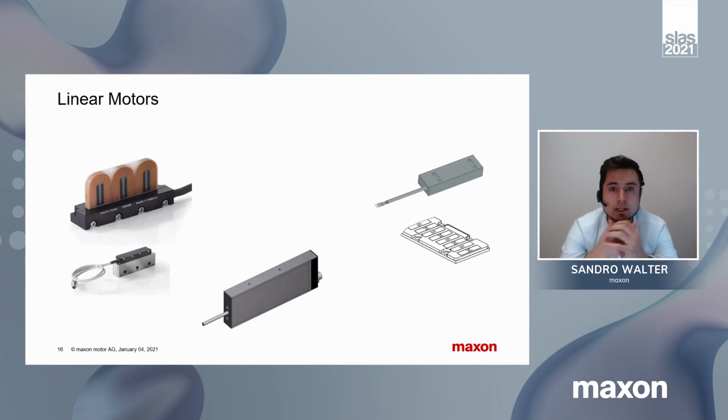And last, another interesting technology for laboratory automation is linear motors. Since there is an increasing demand for higher throughput, reliability, and precision, direct linear motors can be a good choice. Linear motors are direct drives and therefore have a higher precision with the right encoder without having lower speeds. So you have high precision, fast acceleration, and high speeds. In markets such as semiconductor, they have been used for years, and more markets are starting to adopt this technology right now.